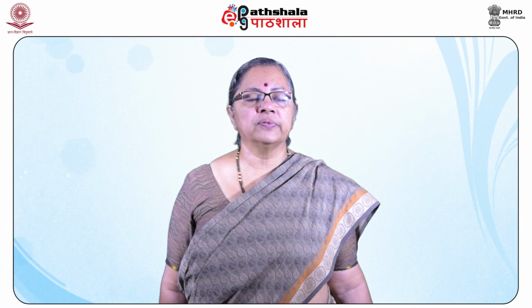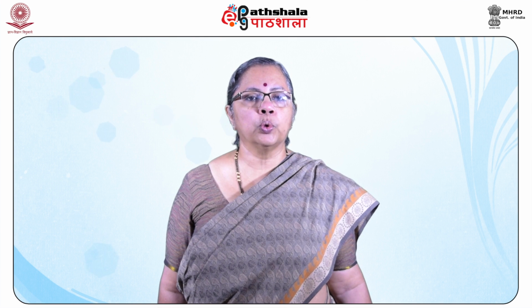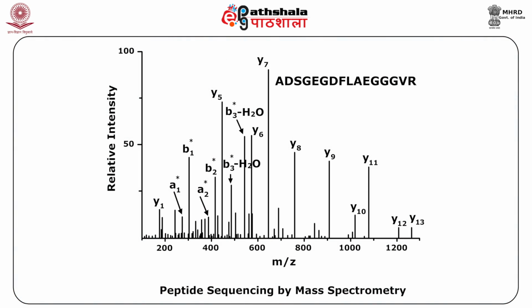Each peptide of the selected fragment from the first mass spectrometer is broken in only one place, usually at the peptide bond. The second mass spectrometer generates one or more sets of peaks, one set wherein the charge was retained in the N-terminal fragment, which is also known as the B-type fragments, and the other set corresponding to the charge retained on the C-terminal fragments, known as the Y-type fragments.